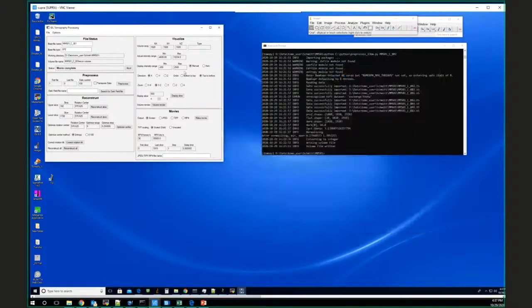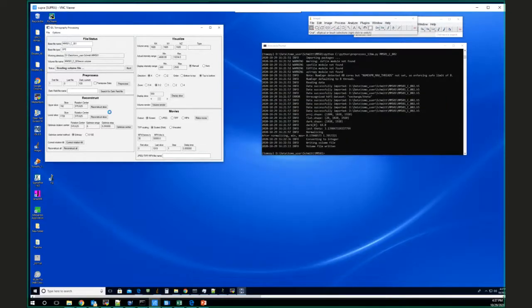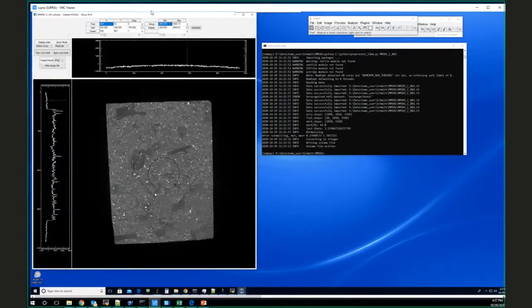Okay, let's go see if we can fix those ring artifacts. So if we go read the volume file again, not the reconstructed one, but just the normalized data. I probably should have done this before I reconstructed it all. But actually flying through that stack gave you a sense of how many ring artifacts there are and how bad they are. So I think the very last slice here, which is 1019, reconstruct that. Yeah, that has a significant ring artifact.